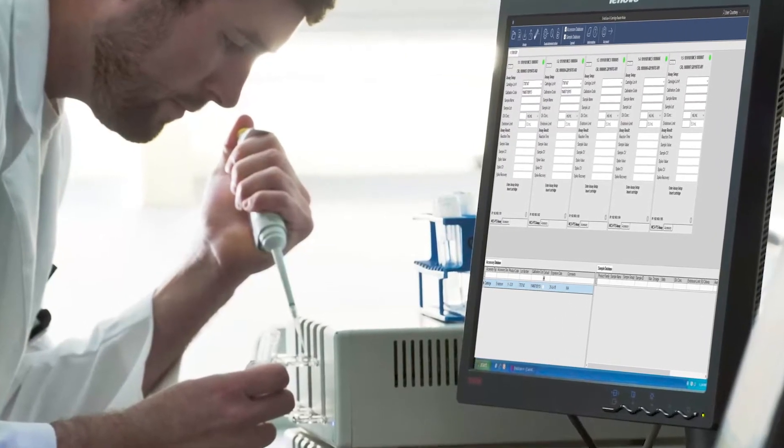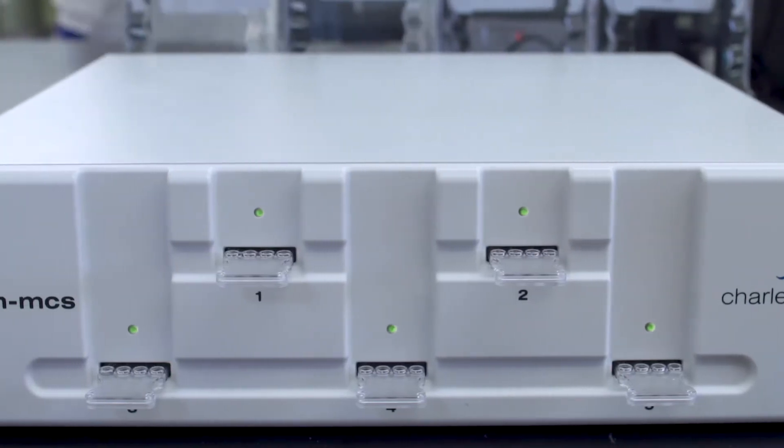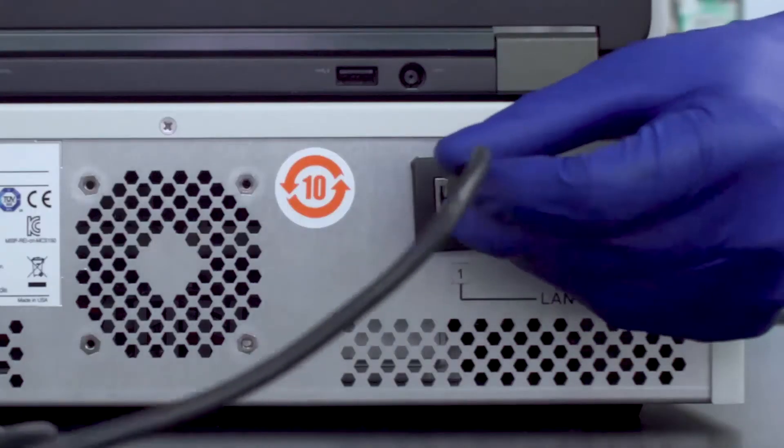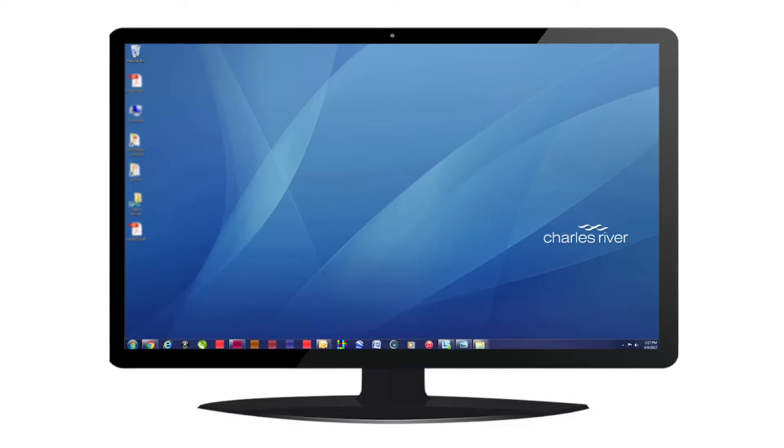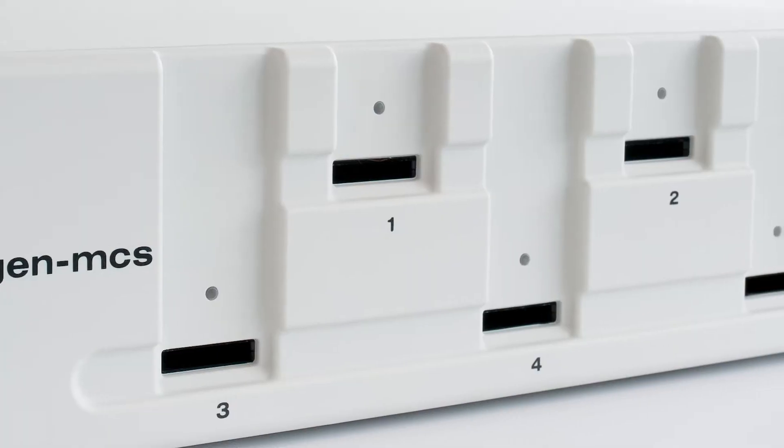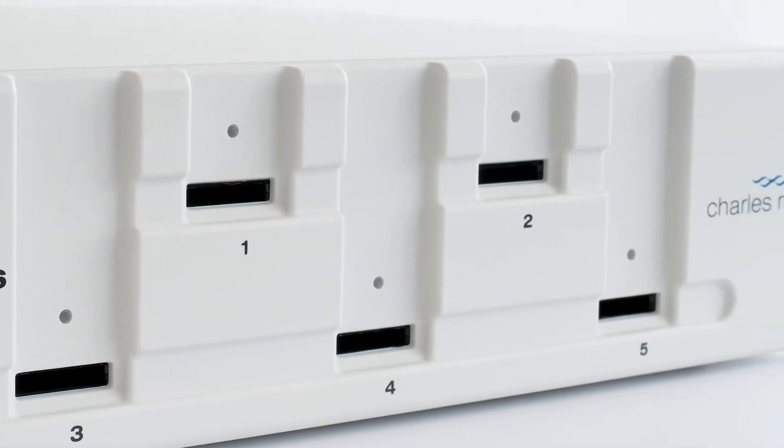The NextGen MCS comprises five individual spectrophotometers built into a unit with an Ethernet connector that links to a computer running our endotoxin measuring software, EndoScan-V, version 5.5.5 or higher. This benchtop test system can test up to five samples in about 15 minutes.